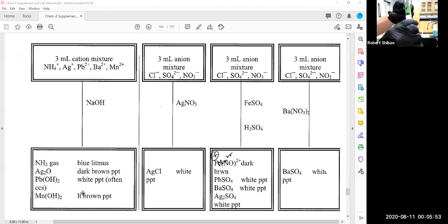And so I'm going to pour it slowly down the side, so it runs down the side into the bottom. I'm not going to grip it with my fingers, otherwise they're going to get very hot. To work an auto dispenser, this is what you'll do. This is basically a syringe. You hold the test tube here at an angle of about 45 degrees, like this. Then you rotate this back and forth until you pull the syringe plunger all the way up until it stops. Now it will dispense 2 milliliters.